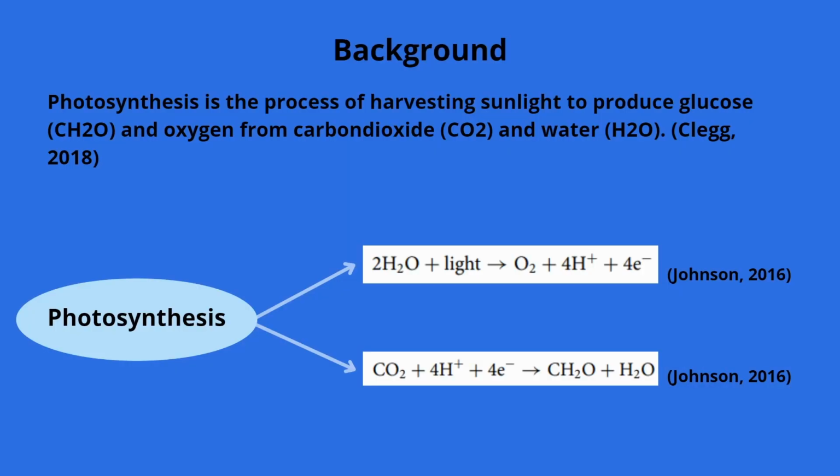My name is, I'm from class 12C, and in this video I'm going to do an experiment with the title of the effect of light intensity on Elodea plant oxygen production. So firstly, there are some things that I need to explain.